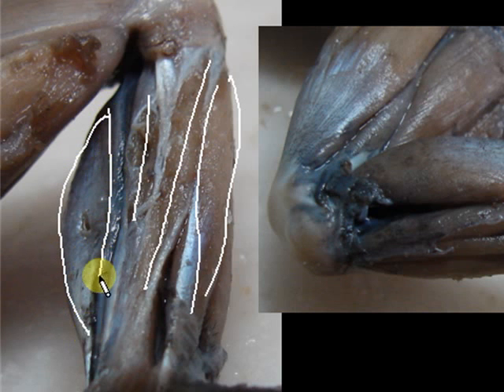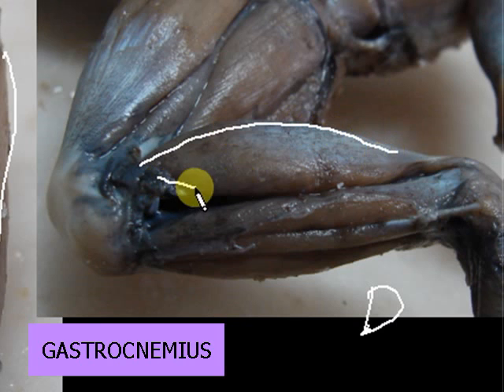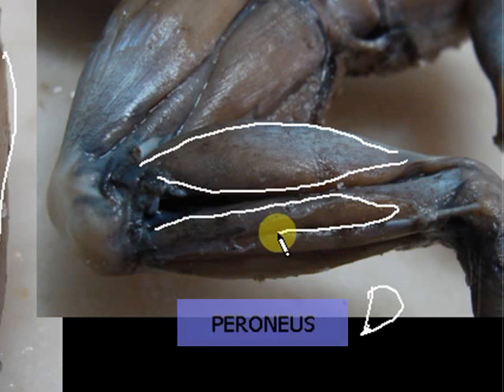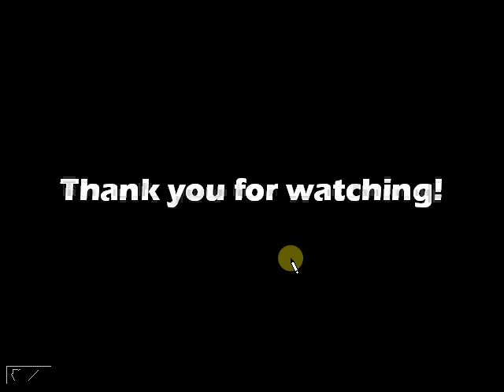The large gastrocnemius muscle can be seen both ventrally and dorsally — from the name, gastro means stomach because it looks a bit like a stomach. Finally, the peroneus muscle can be seen dorsally. Those are the muscles of the shank. I hope this has been a good review and I wish you luck in your exams. Thank you very much for watching.